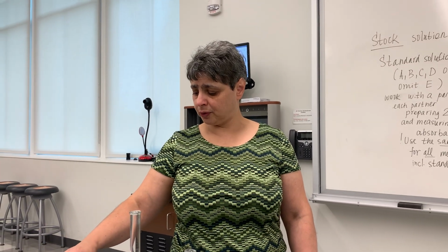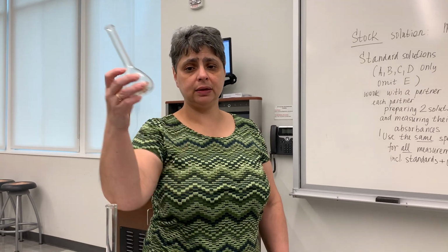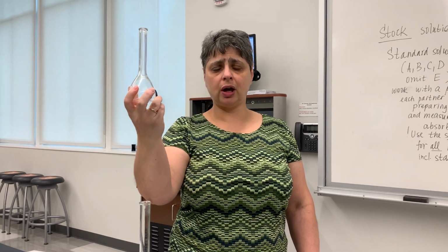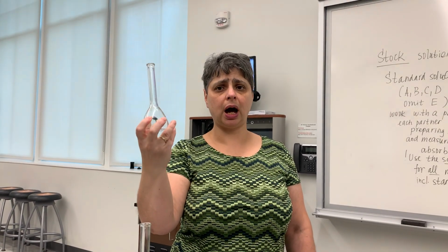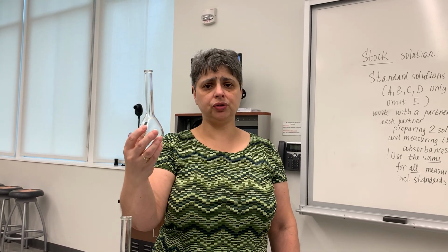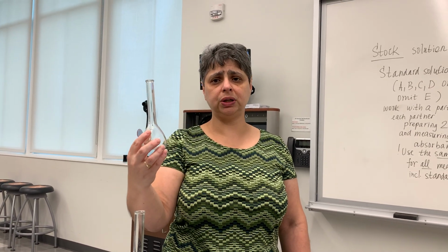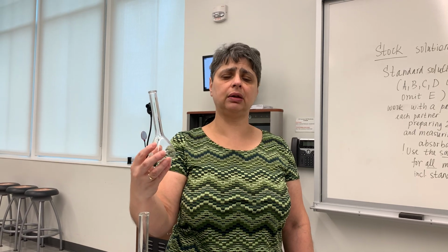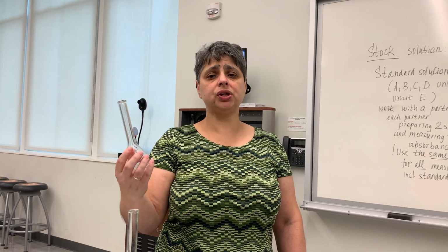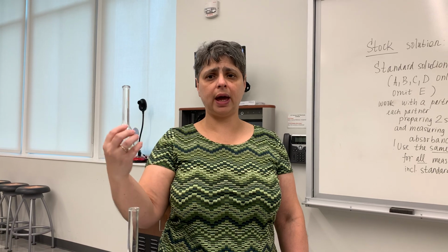And then from there it asks for the concentration of aspirin in this solution made from the tablet. You cannot find this concentration until you use your data for standards to create a calibration graph. Once you get the calibration graph, which as we discussed should be linear with the y-intercept equaling 0, which you can set in Excel, set the y-intercept to 0 for your graph, get the equation of the line, which will look like y equals a certain numerical value times x.